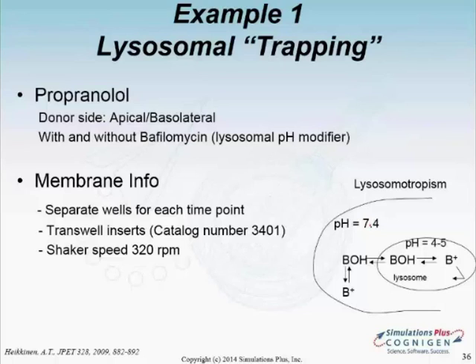We had some discussions recently on this effect of having class 1 compounds with fairly late Tmax, and from our experience for some of these compounds, we were able to attribute this to the trapping in the enterocytes. So again, this is one of the features that MembranePlus could help you to answer the question, or the magnitude of this effect.